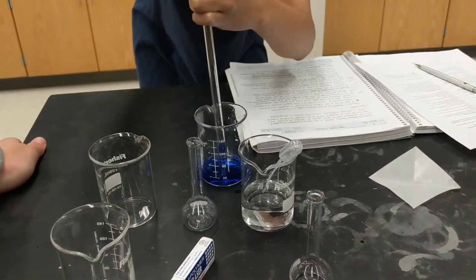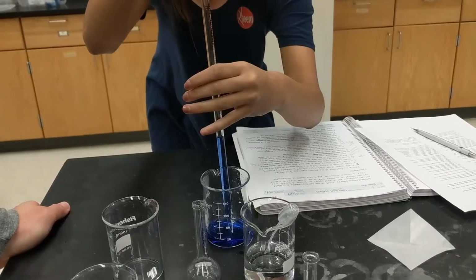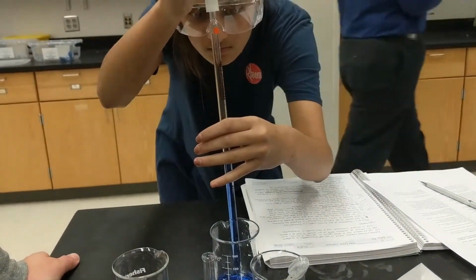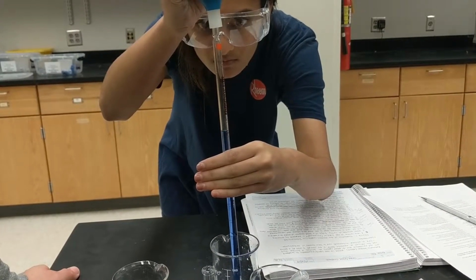Pour your solution into a clean, dry beaker. From your solution, use a 25 milliliter volumetric flask to create a dilution. You will continue this 3 times, making sure to use the newest dilution as the stock each time.